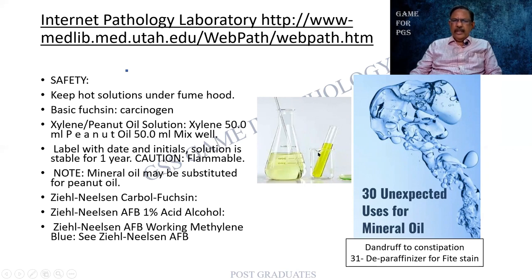This is a sample of the mineral oil that is given over here, and this is the mineral oil. What are all the uses of it? There are multiple uses, 30 unexpected uses of the mineral oil, changing from dandruff to constipation. And I put the 31st one as deparaffinizing for the Fite stain.